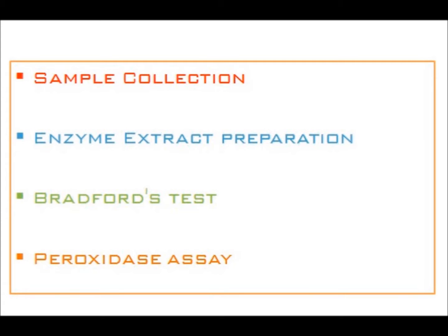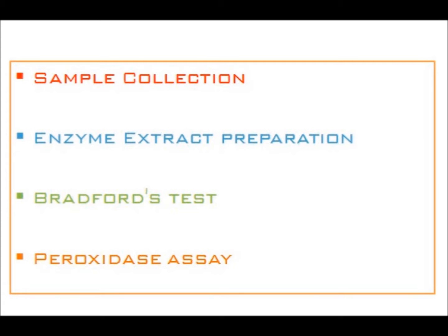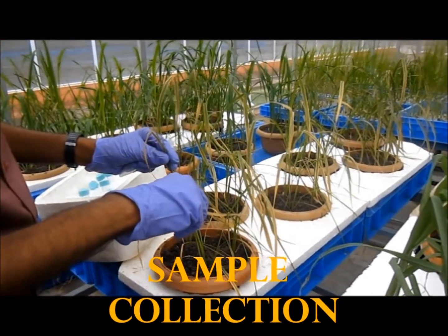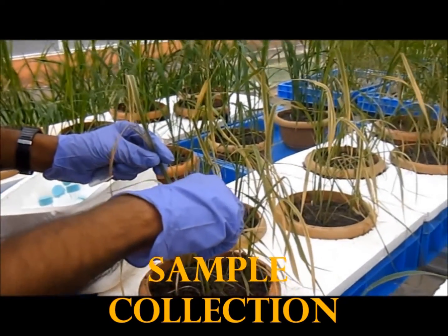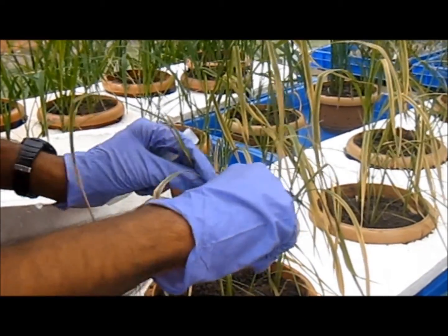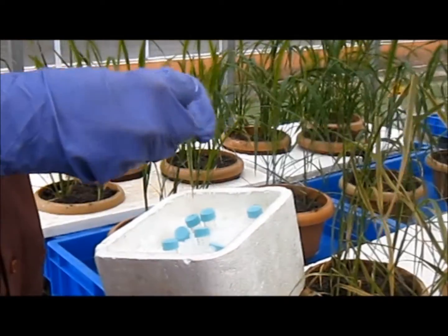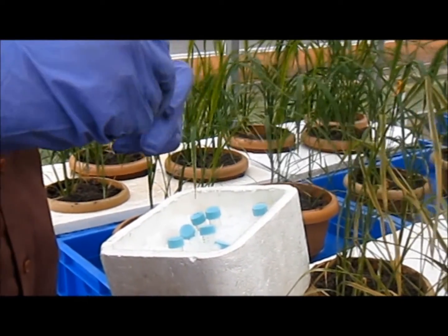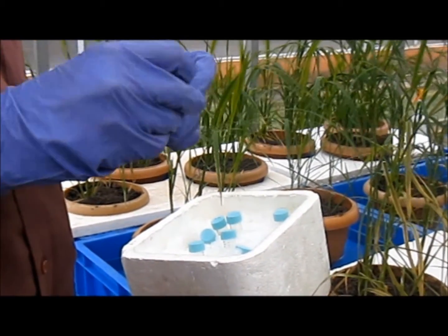The first step is sample collection. After a few days of stress, the top three leaves are collected from the plants. The leaves are properly folded and inserted into the falcon tube, which is then kept in ice immediately.